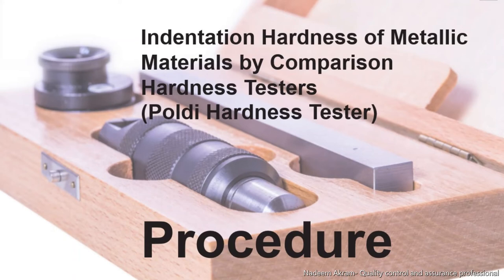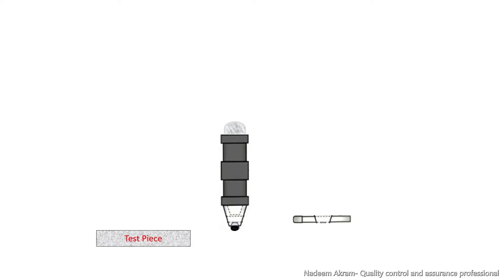This video outlines all steps required to measure hardness by Poldi hardness tester. After cleaning, assemble the standard bar into the apparatus by inserting the tapered end of the standard bar into the space provided.